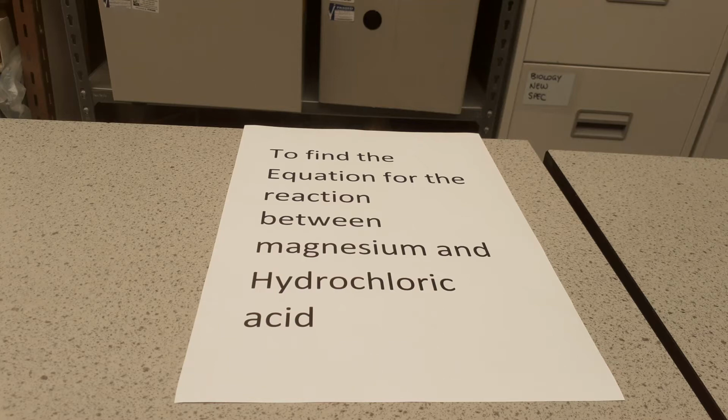In this video we're going to determine the equation for the reaction between magnesium and hydrochloric acid.